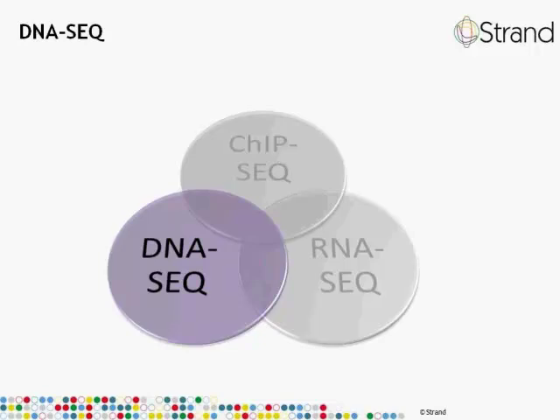We will talk about the SNP analysis in more detail in the next section, which focuses on DNA variant analysis in cancer biology. But the major functionalities of the SNP analysis features remain the same in both the DNA-Seq and the RNA-Seq workflows.